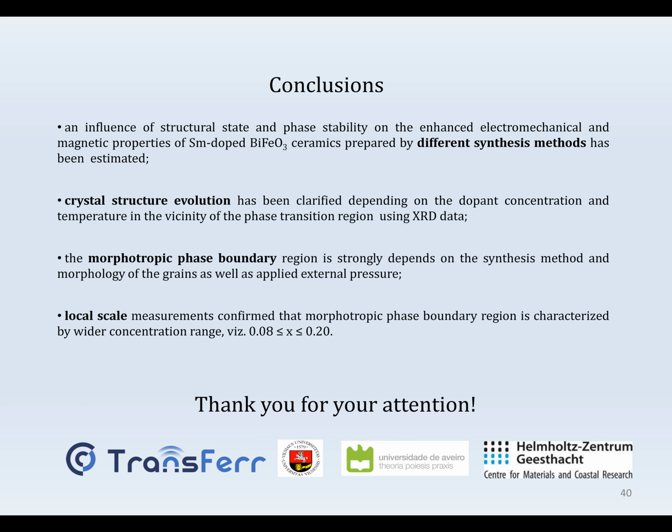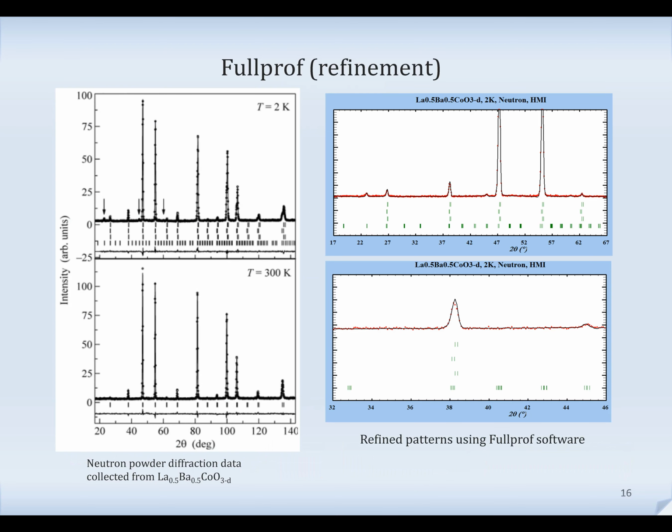I think the neutron diffractogram or several X-ray, slide 15 maybe. So this one, yes? For example, this is, yes, 2.8 in d-space. So this is very, very important.